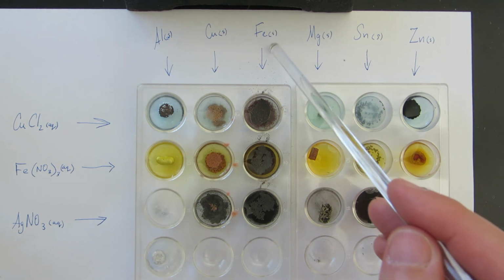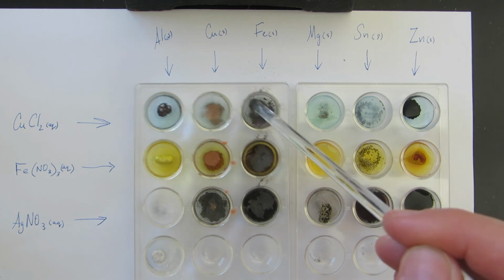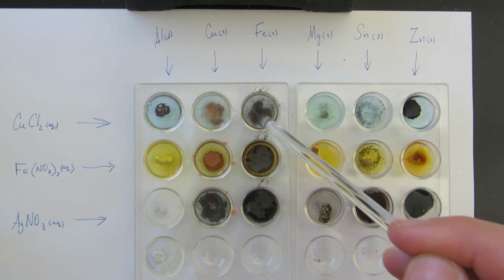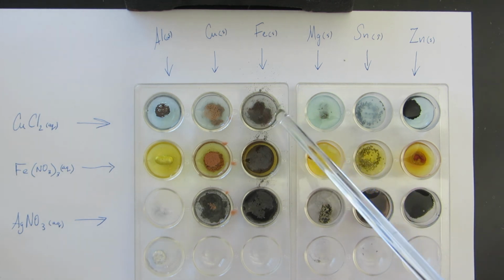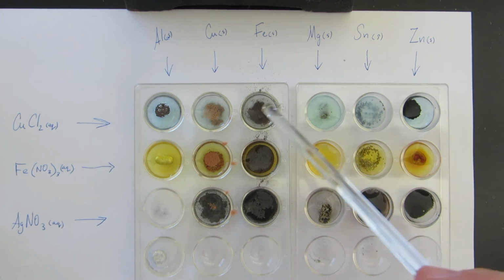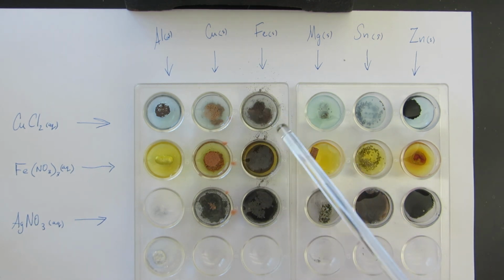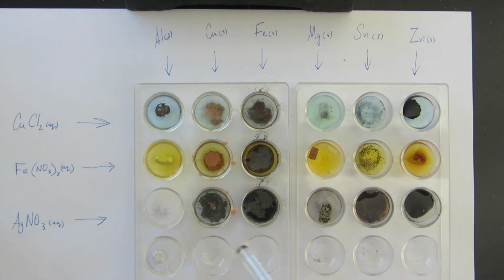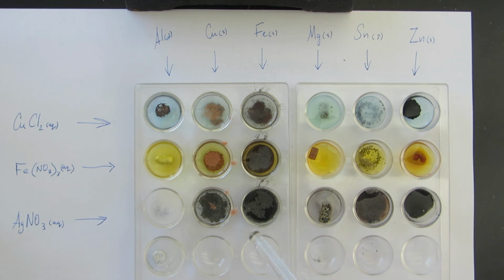The iron looks like we see something going on in here. So that would tell us that, and you can see the solution here is clear, right? So the copper ions have come out of solution, so you can see that. So the iron must be more reactive than the copper. Iron and iron, no real need to compare. And then down here, iron and silver. So yeah, it looks like iron is more reactive than silver. You definitely see something change there.